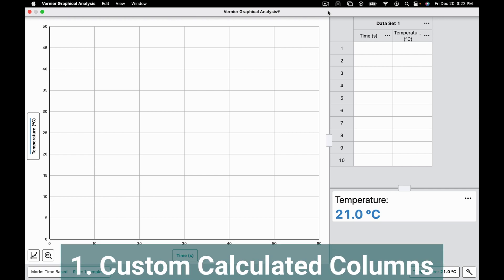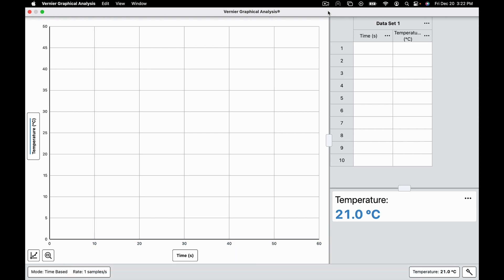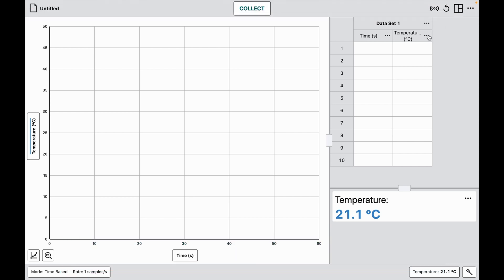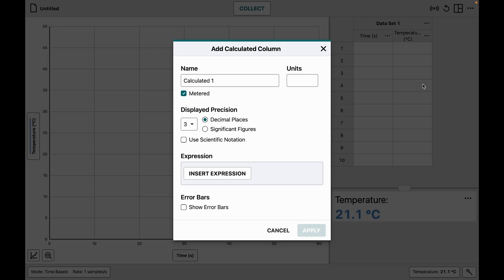The first feature is custom calculated columns. In this experiment I have a temperature probe showing temperature in Celsius, but I also want to show temperature in Fahrenheit. I click on the column options button and choose to add a calculated column.